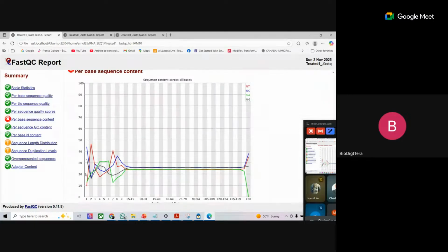When you are doing the PCR, this can be the primer site or adapter site, because it is the end. See, both ends here as well. They are not flat and parallel. See, at the end, it starts doing bad stuff. Here also, it starts doing things that we don't like, not neat and clean as here.